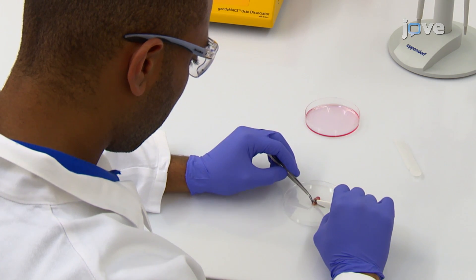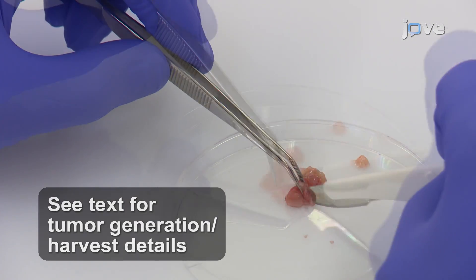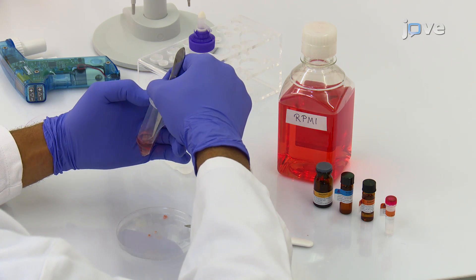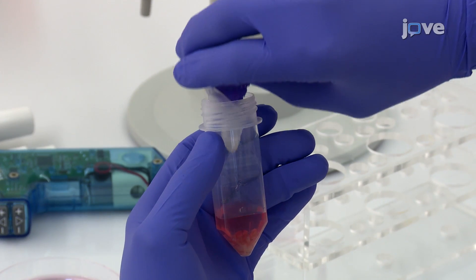Begin by using forceps and a scalpel to remove the fat and necrotic areas from the tumor sample. Then mince the tumor into 2-4 mm pieces. Next, transfer the tissue fragments into a single cell suspension dissociation tube containing the digestion mix and tightly close the tube.